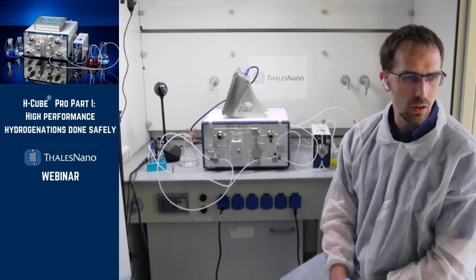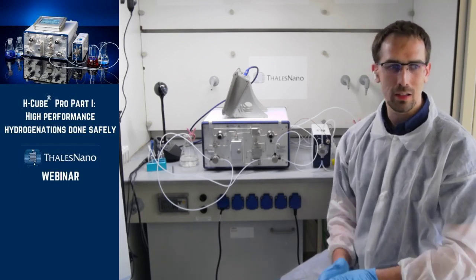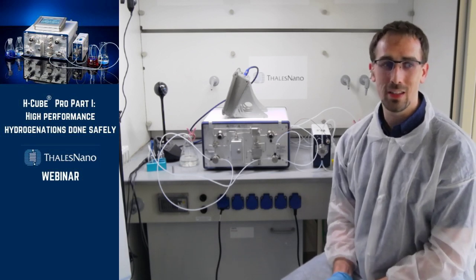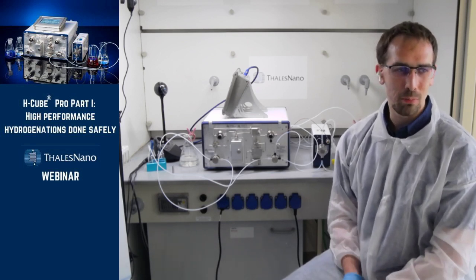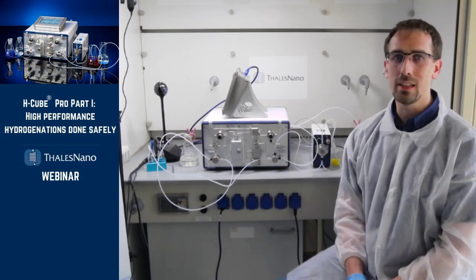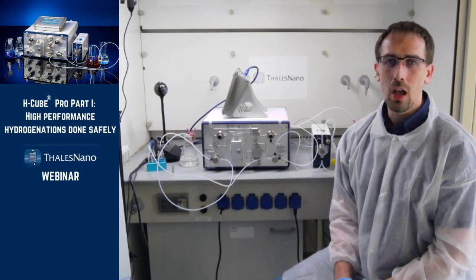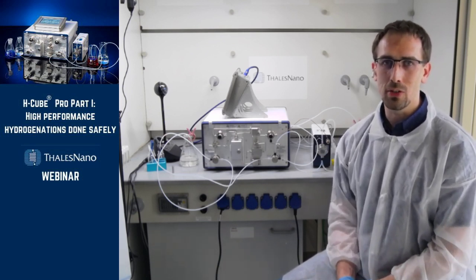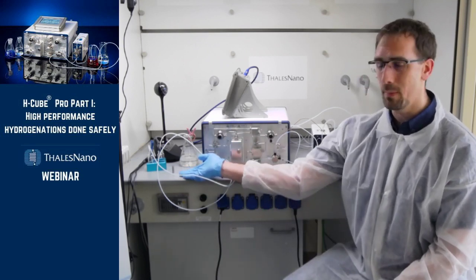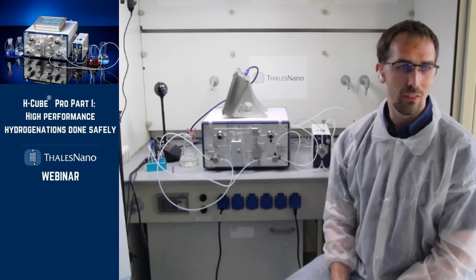What is the cost of prepacked palladium and Raney nickel cartridges? I am not familiar with the prices. The prices also depend on the actual market. So please drop our sales team an email and they will give you detailed pricing. They also need to know the size of the cartridge which you are interested in. Obviously the price for a 30 millimeter cartridge differs from a 70 millimeter one.